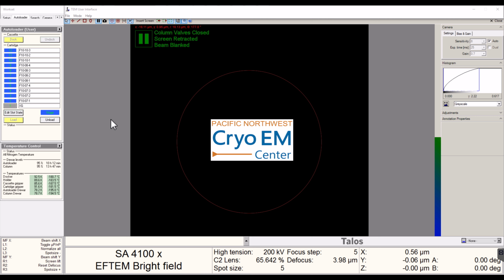Hello everyone, this is Marcelo with PNCC, and today we'll show you how to create a new Atlas session.